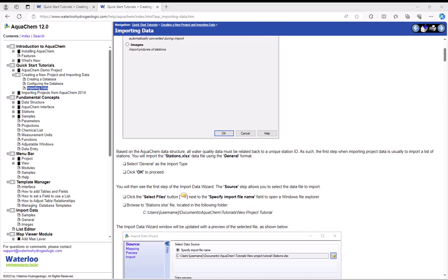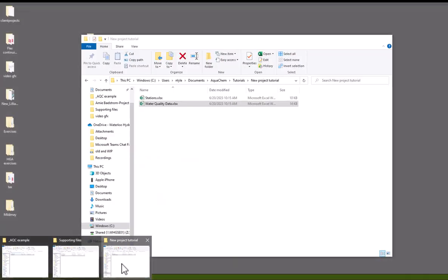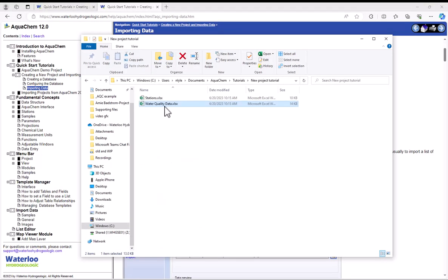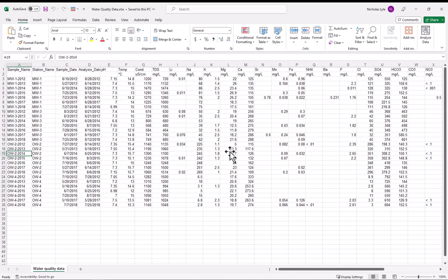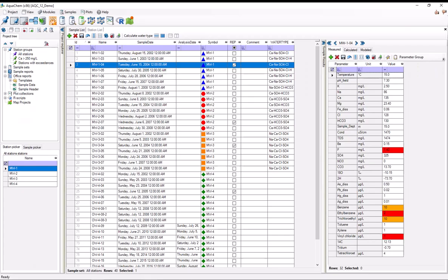And if we open this up, you can see that you've got several samples for you to import. This might be useful for you if you're interested in a template that you can model your own data off of. There's also a similar file for station data. But anyways, I'll go back to AquaChem.